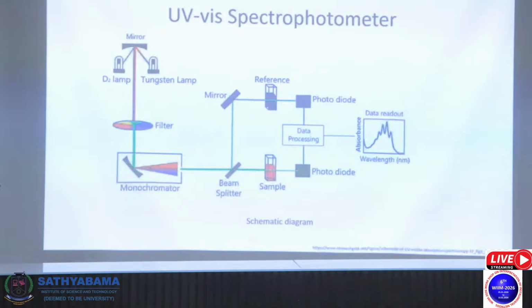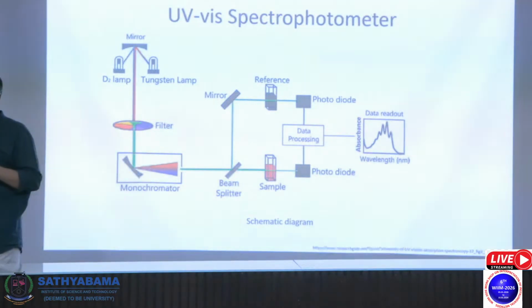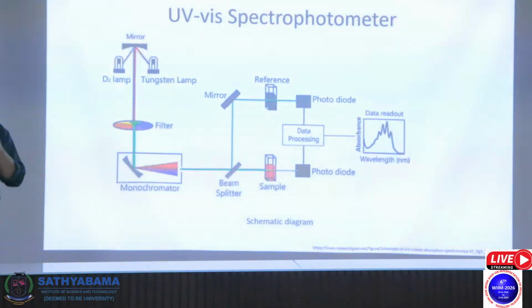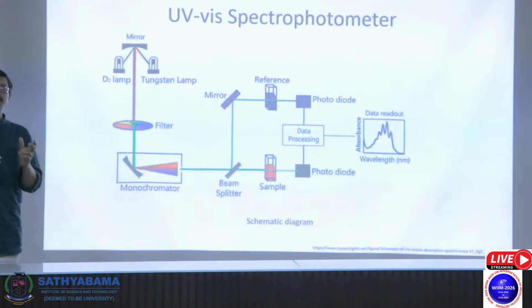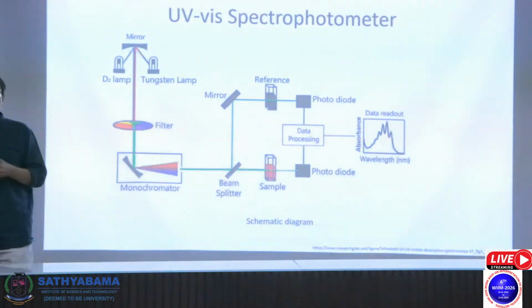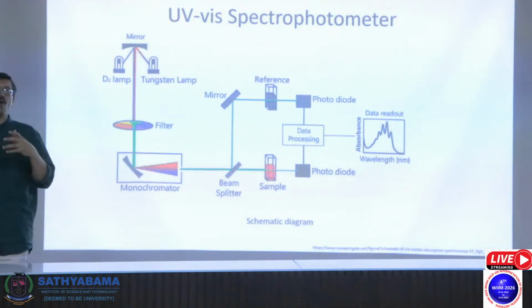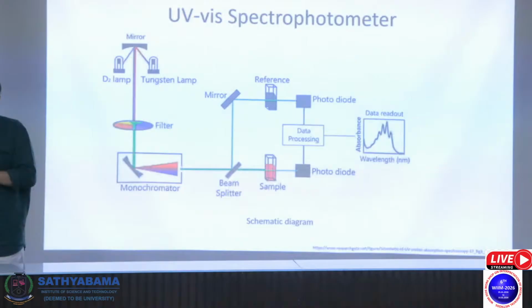if you want to measure how much light is absorbed by a molecule, an instrument called a UV visible spectrophotometer is used. Many of you must have used it, but some of you did not. Essentially, it works on the principle of transmittance. See, light is falling on a molecule. Red. What does it mean? Green light is absorbed. So by measuring transmitted light, you know what light is absorbed. That is the principle of this UV visible spectrophotometer based on the transmitted measurements.